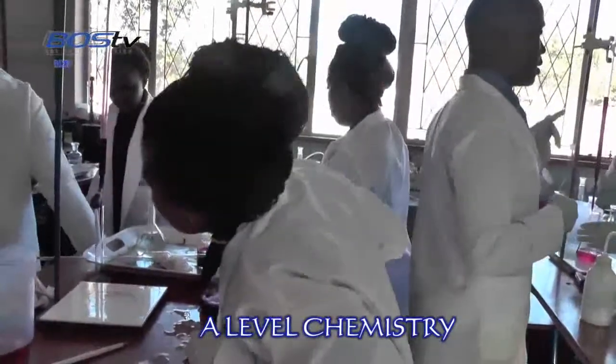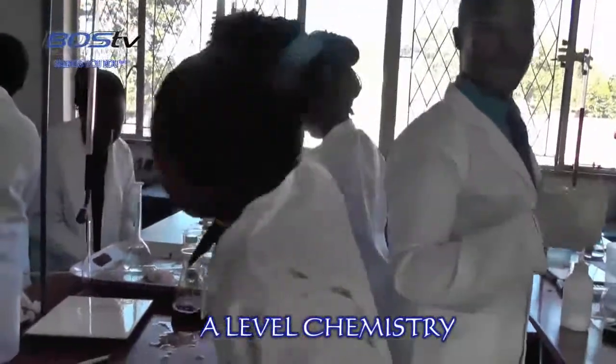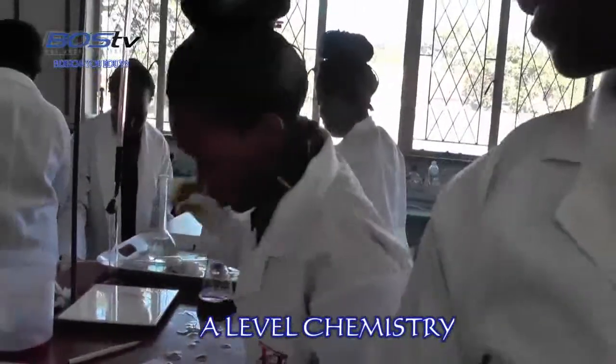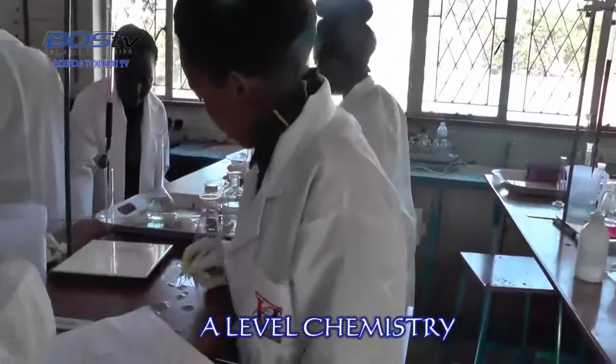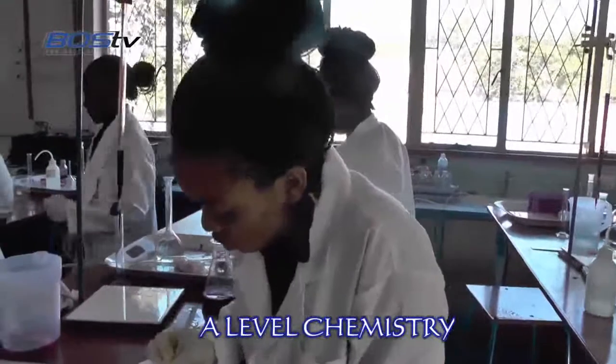That's your upside. That means your end point should be around 30 or something. 36 is your end point. Yeah, now close it. That's your rough titre. Now do an accurate titre.